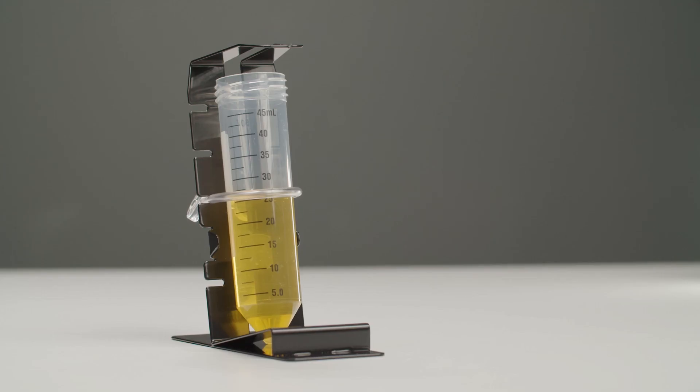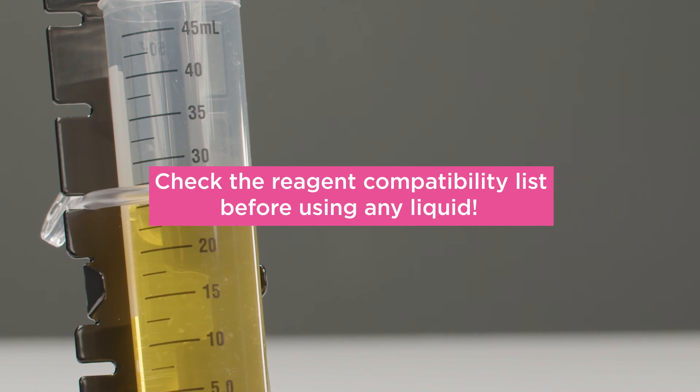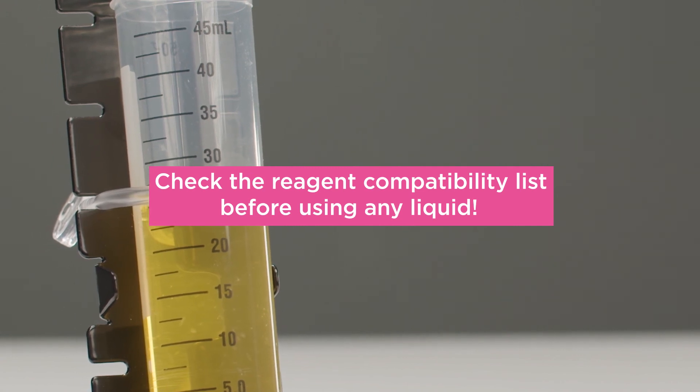Carefully clean the end of the injector needles with a cotton swab soaked in ethanol or isopropanol. You can find a reagent compatibility list in the instructions for use. Please check the list thoroughly to know which reagents must not be used with the injector system to prevent any damage.